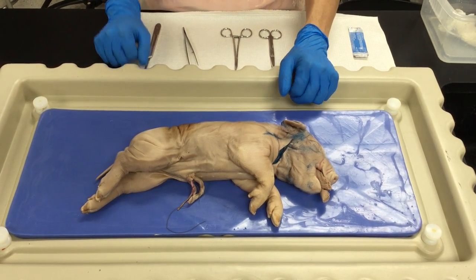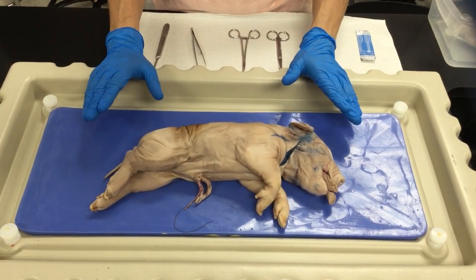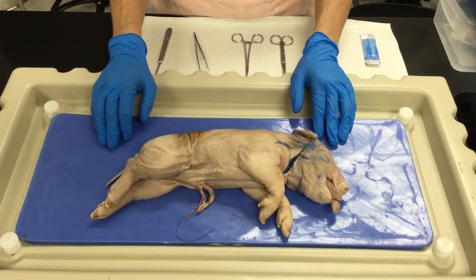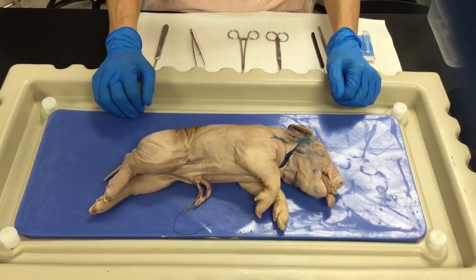In this video we're going to do a fetal pig dissection just to see the internal structures of the thoracic and abdominal cavities so we can study the different organs within these systems.